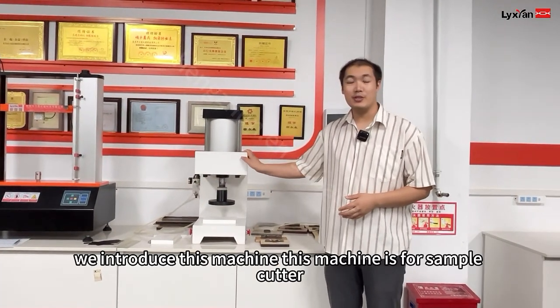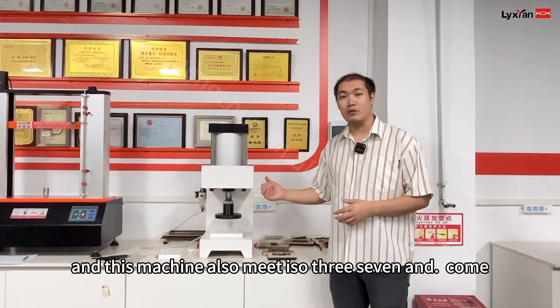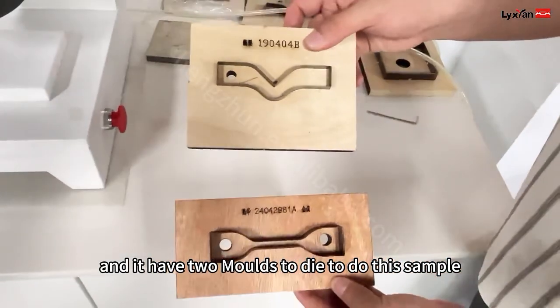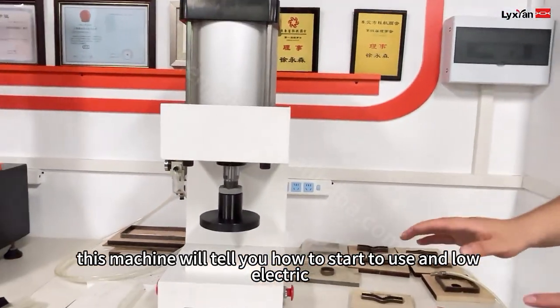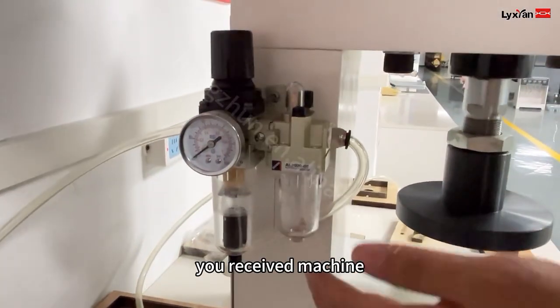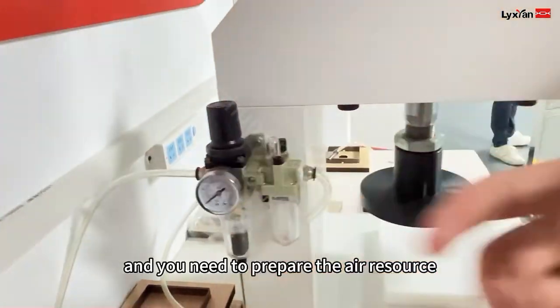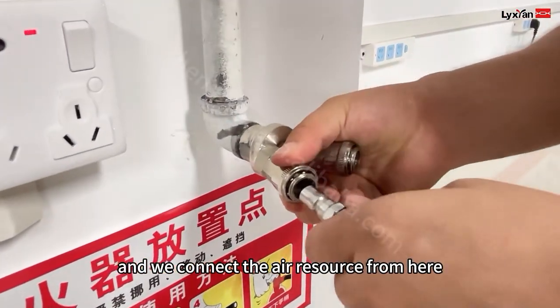Next, we introduce this machine. This machine is for the sample cutter for rubber testing. This machine also meets ISO 37. It has two modes to cut the sample. This machine will show you how to start to use. And no electric — this machine has no electric, it is only for air resource. Normally when you receive the machine, we will give you a paper insert. And you need to prepare the air resource, and we connect the air resource from here.